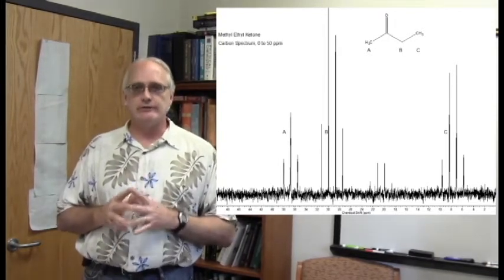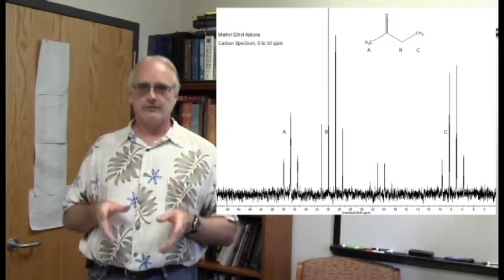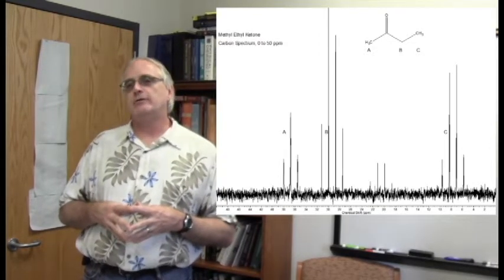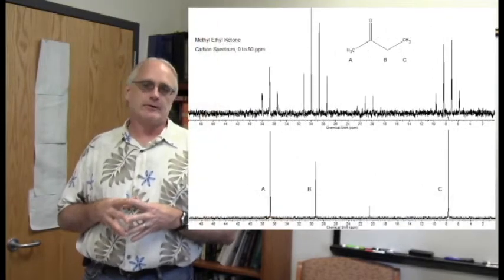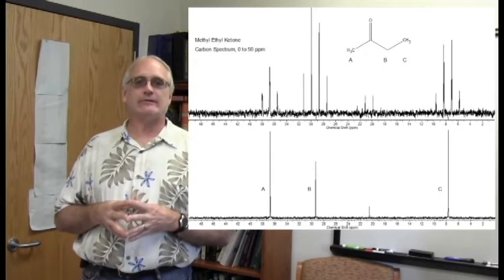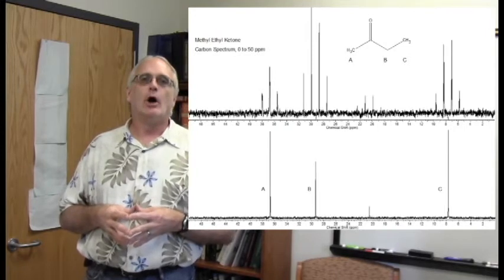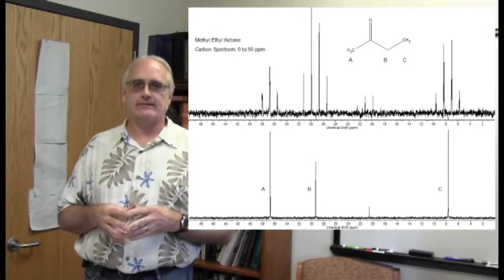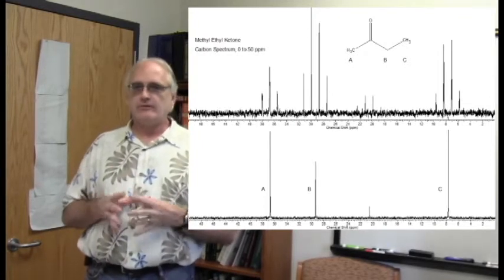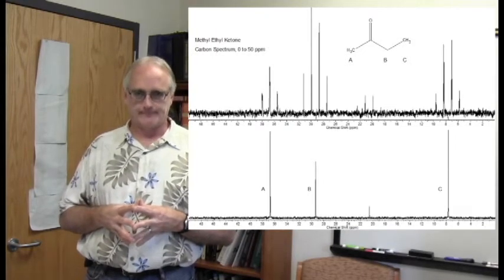The carbons do couple to hydrogens that are attached to them and give all of the coupling patterns that we would expect to see. So here are the two spectra together for comparison. And I want you to see that the centers of these things, either the singlets in our regular normal appearance spectrum or the triplets and the quartets in this strange looking spectrum here, the chemical shifts are exactly the same. They line up with each other very nicely.